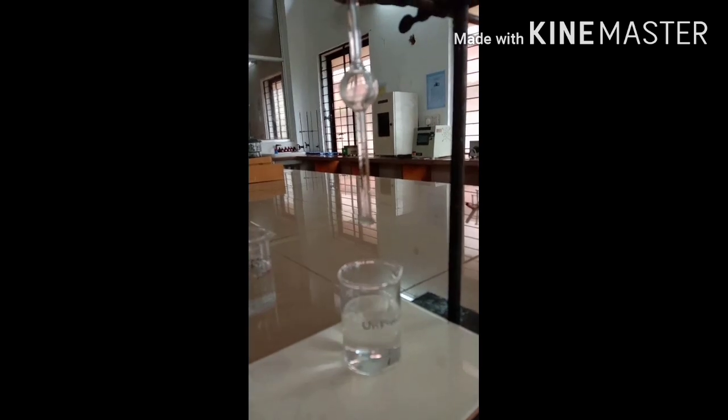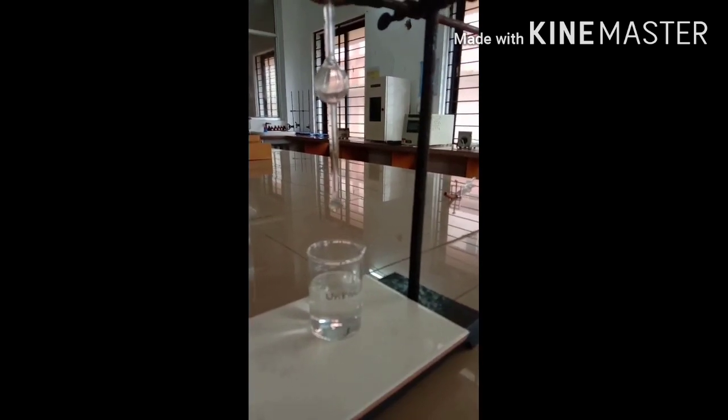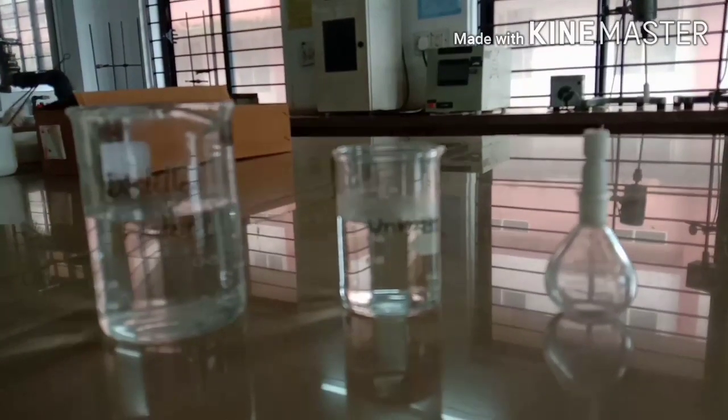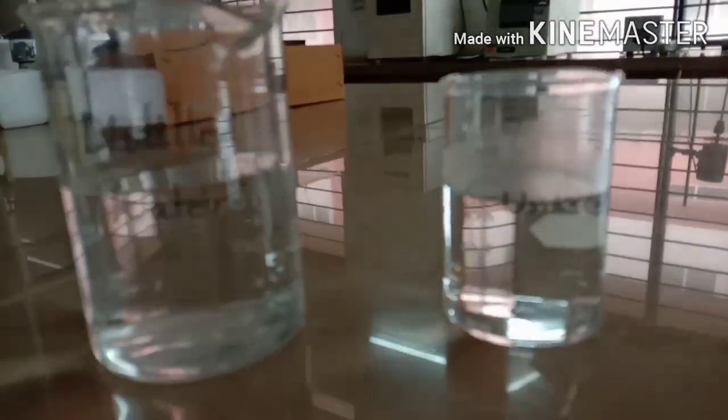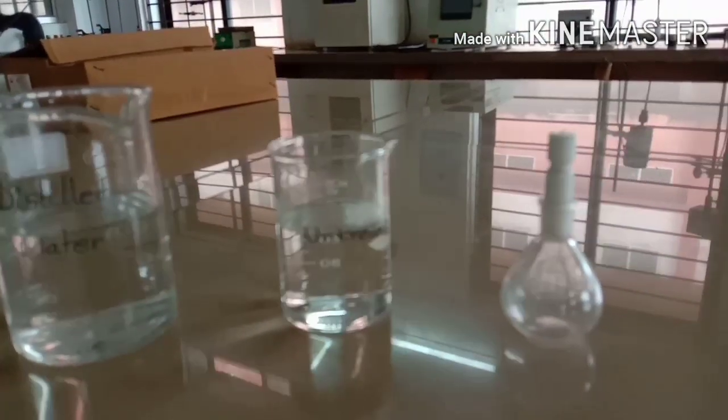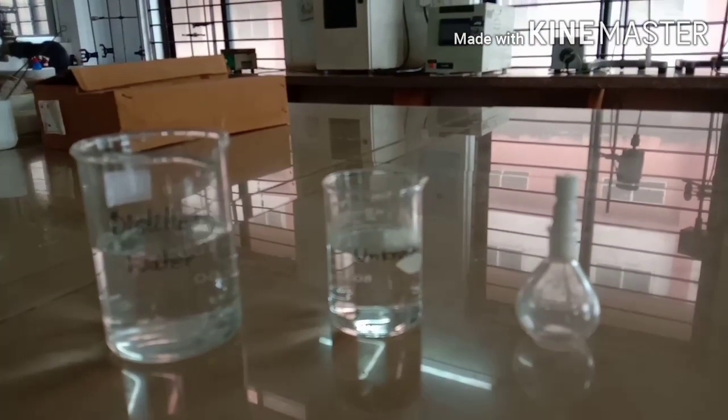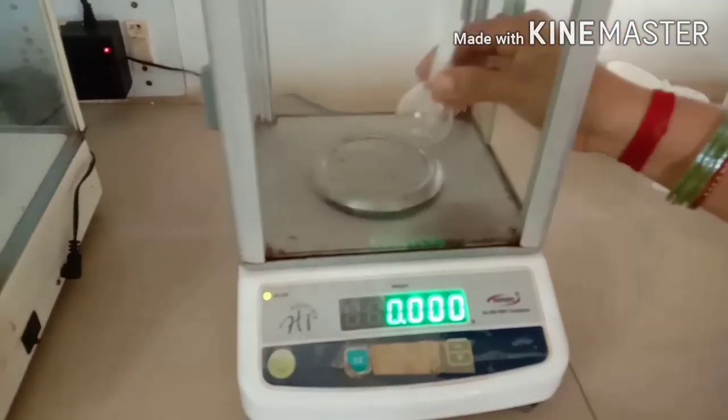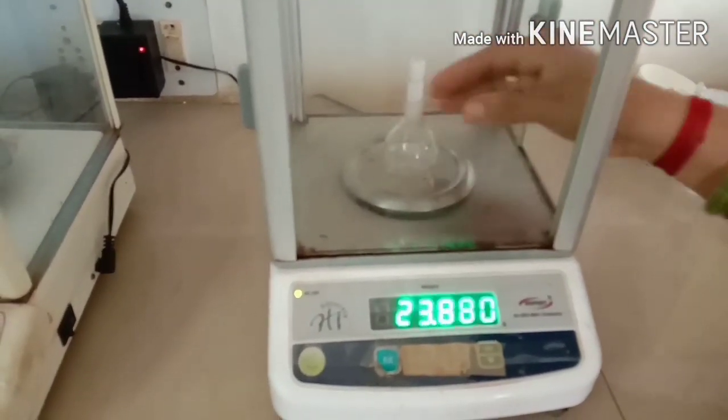Next is determination of density of unknown liquid by using specific gravity bottle. First, weigh the empty specific gravity bottle.